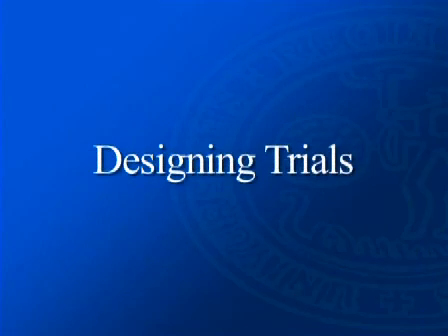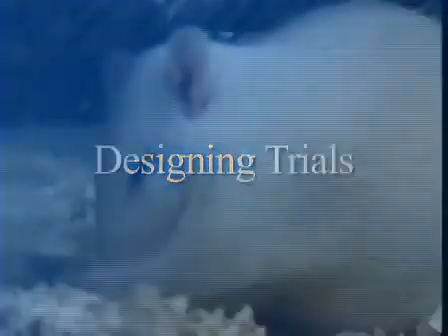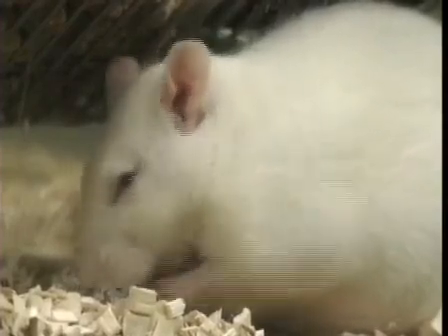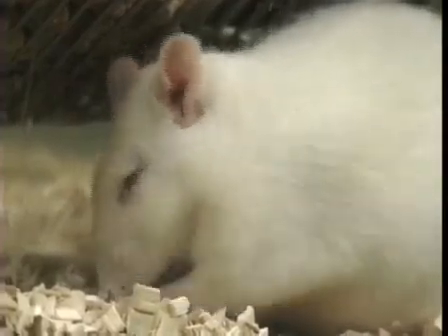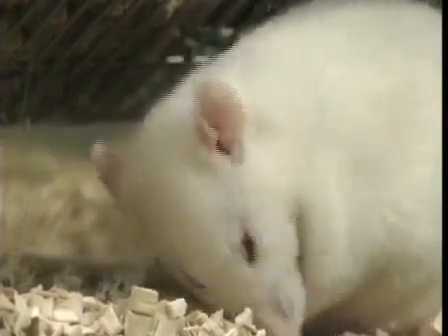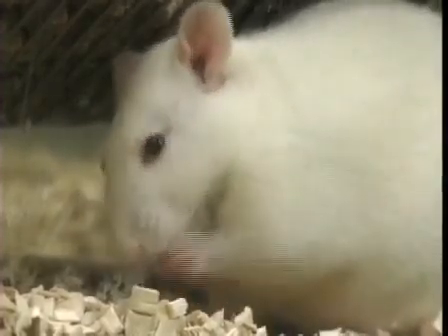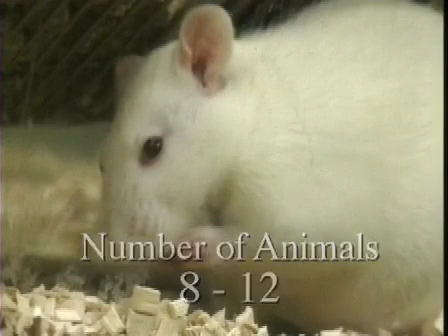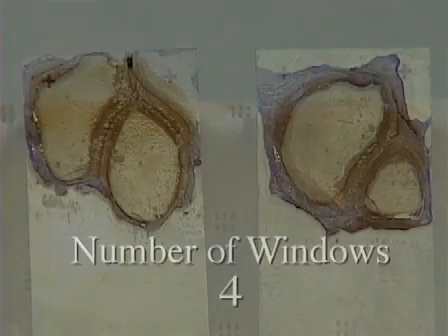Designing trials. As there can be significant differences between animals in the same treatment group, and even between mesenteric windows in one and the same animal, we have found that the following design may prove practical. 1. The number of animals per treatment group and time of observation: 8 to 12. 2. The number of windows per animal that are analyzed in terms of VA: 4.